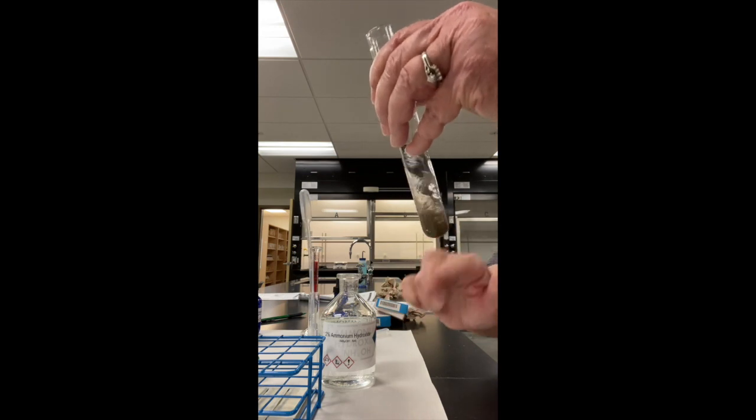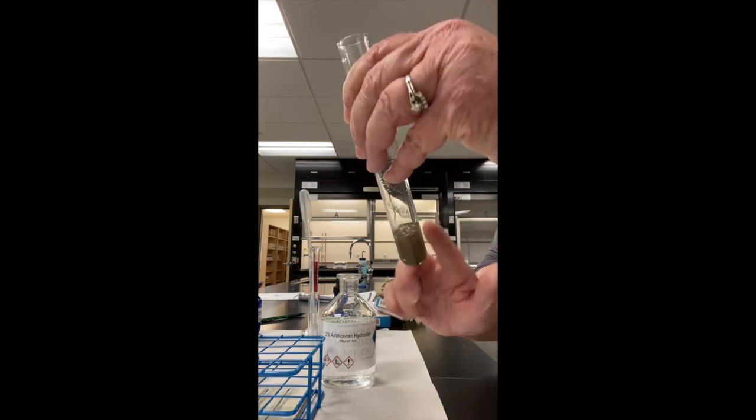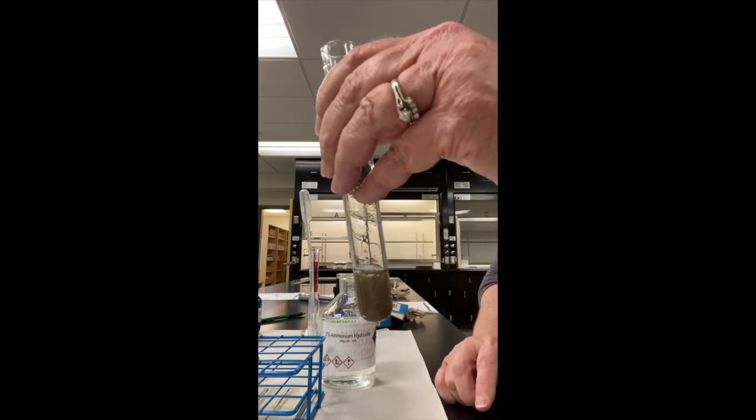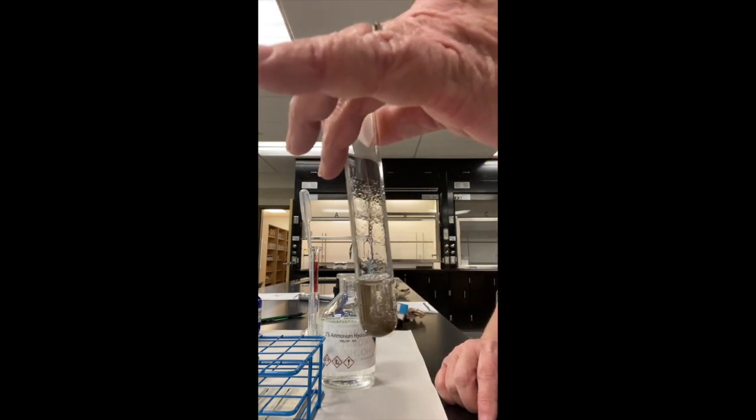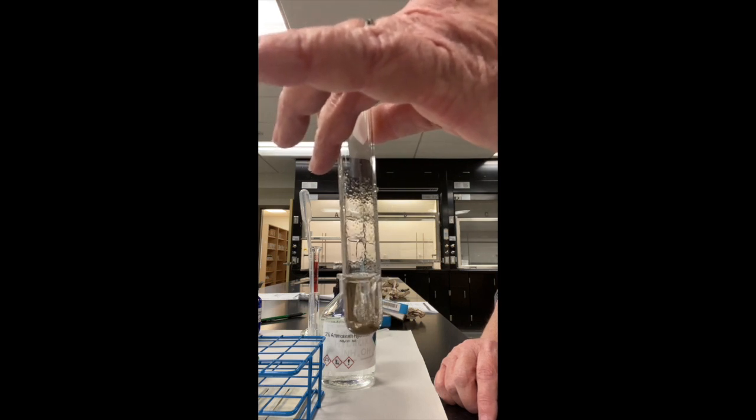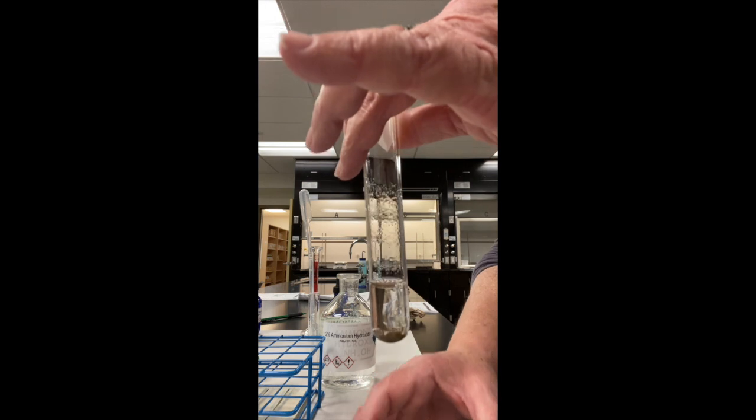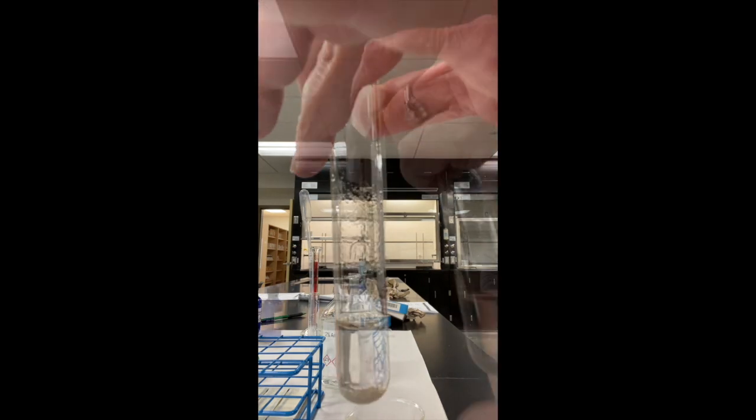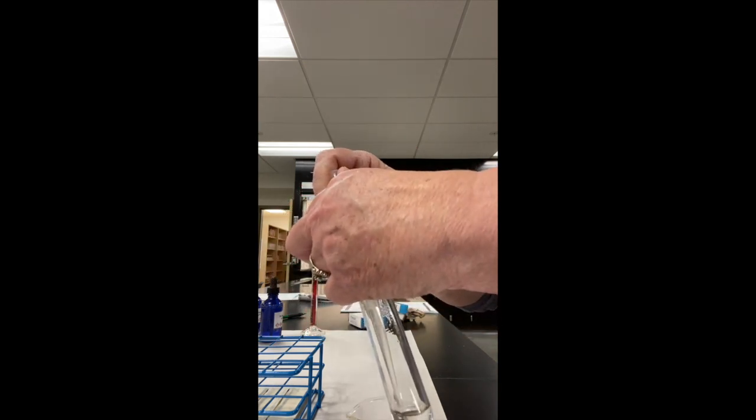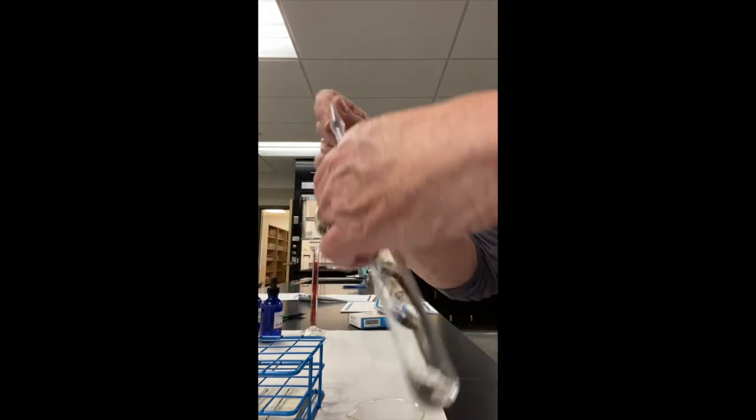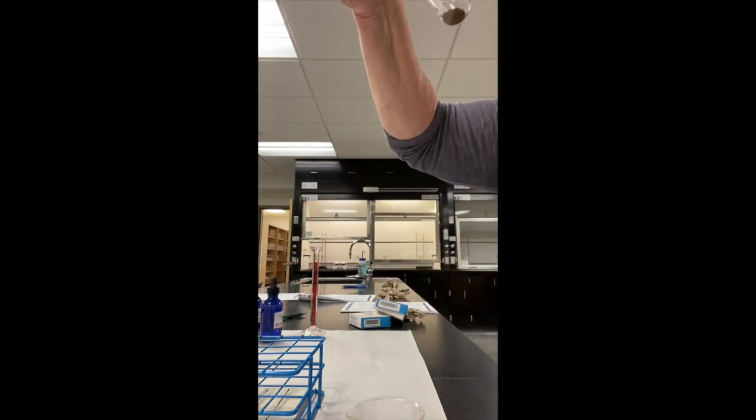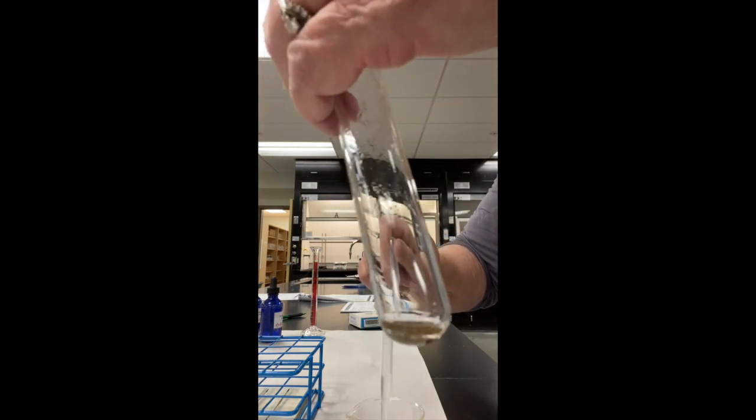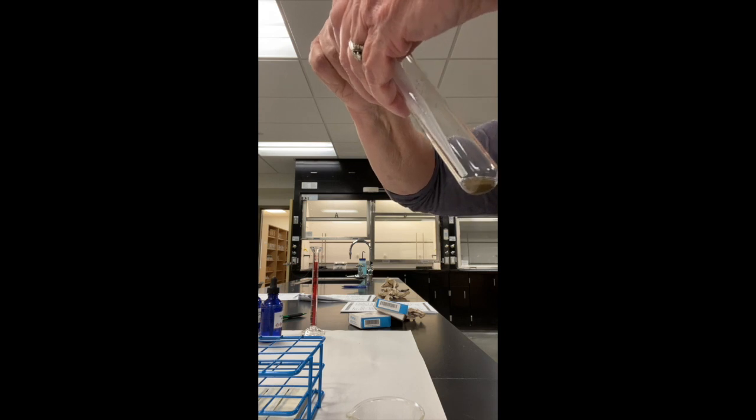And then I'm going to actually transfer by decanting. I'm going to transfer just the liquid. So I'm going to allow the solid to settle to the bottom. Then I'm going to use a transfer pipette and I'm going to go ahead and put it in this so I have a little easier time to put it in my test tubes. I'm going to go ahead and transfer just the liquid, not the precipitate that remained on the bottom. This is called decanting because I let the solid settle to the bottom and I'm only removing the liquid from the top.